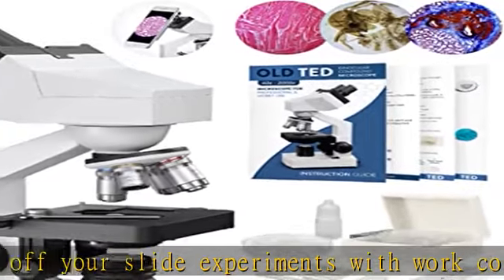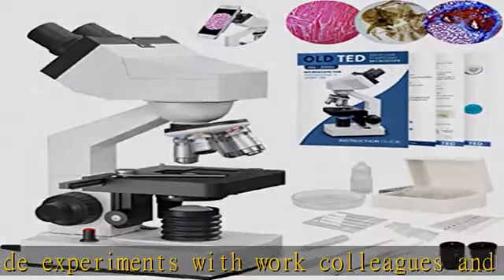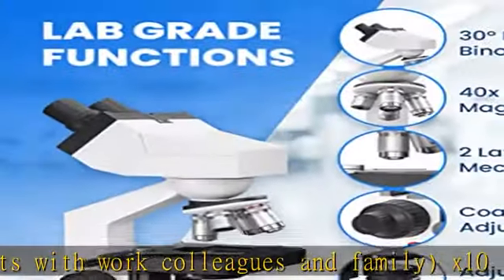Microscope kit for adults. The professional packaging is designed with a carry handle for easy transportation and use.